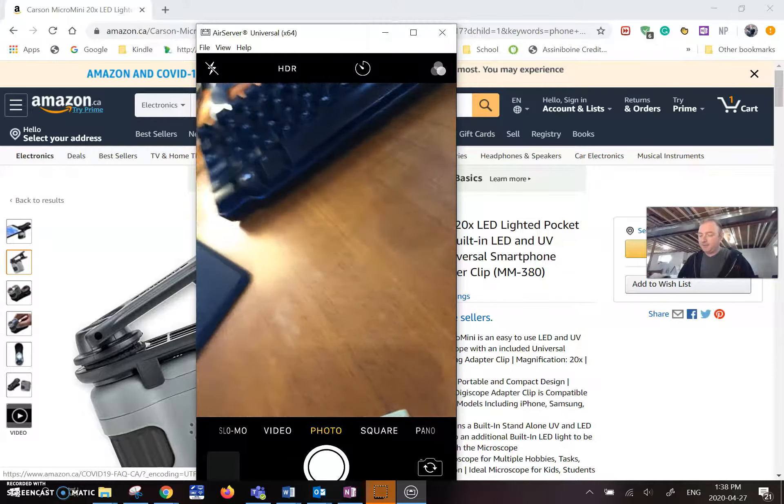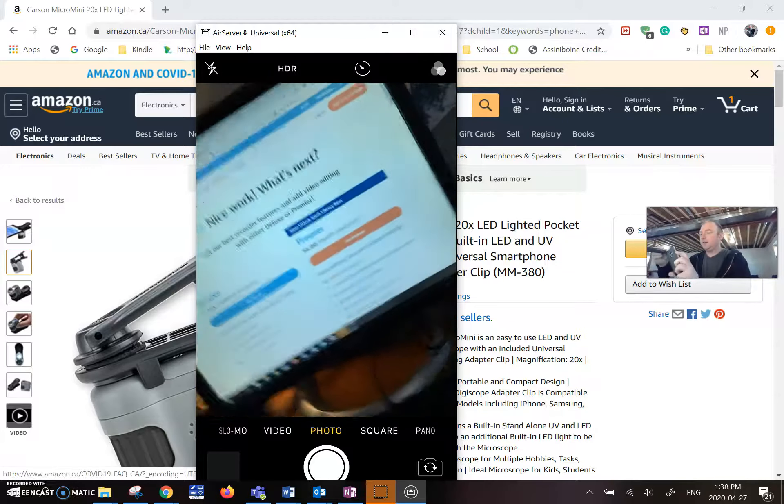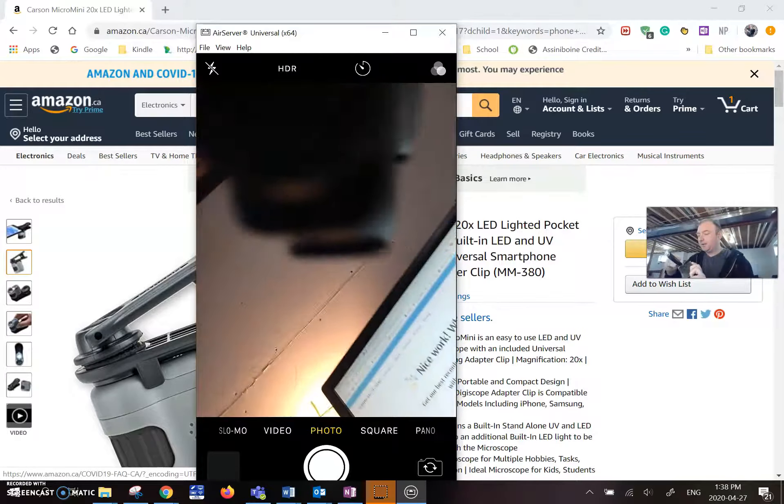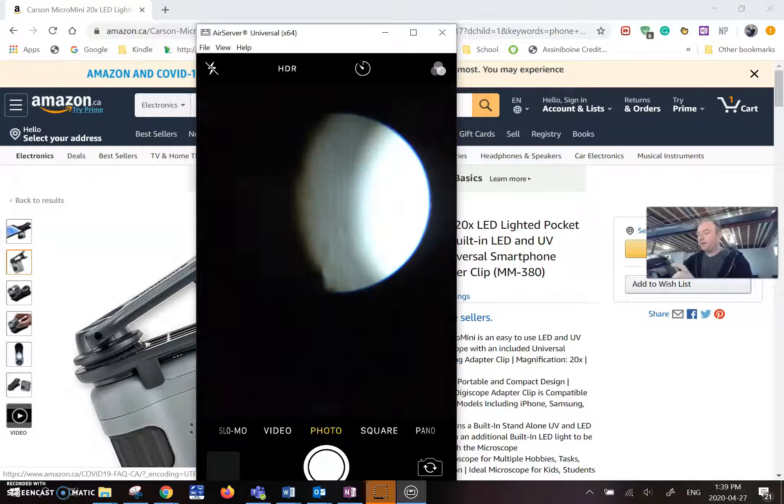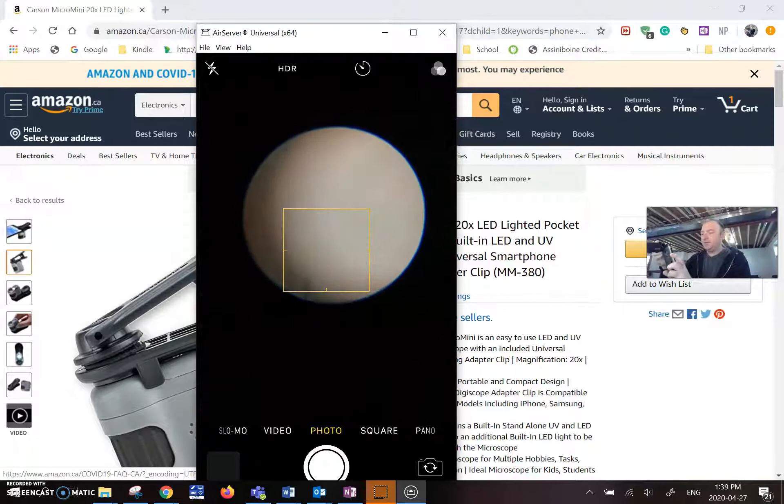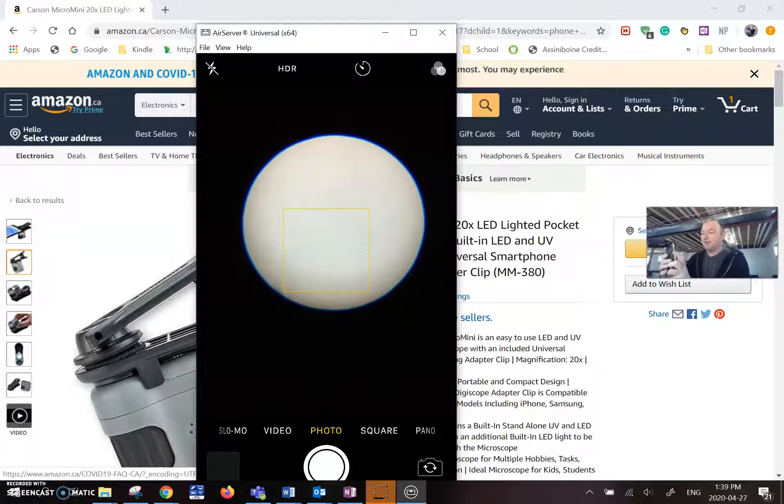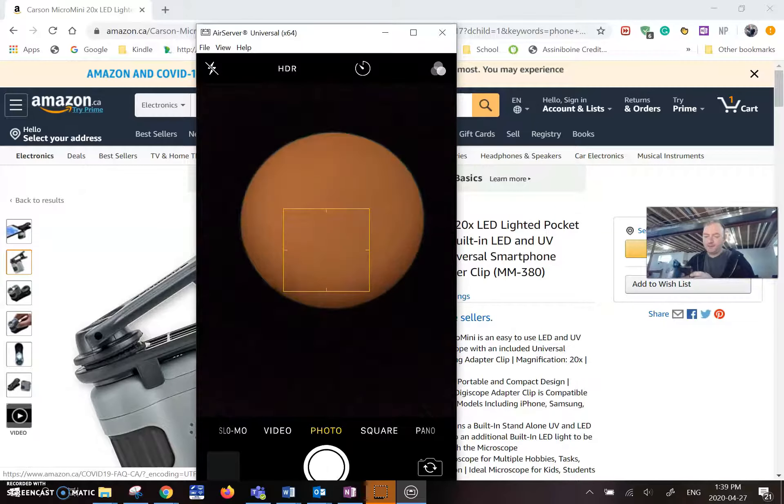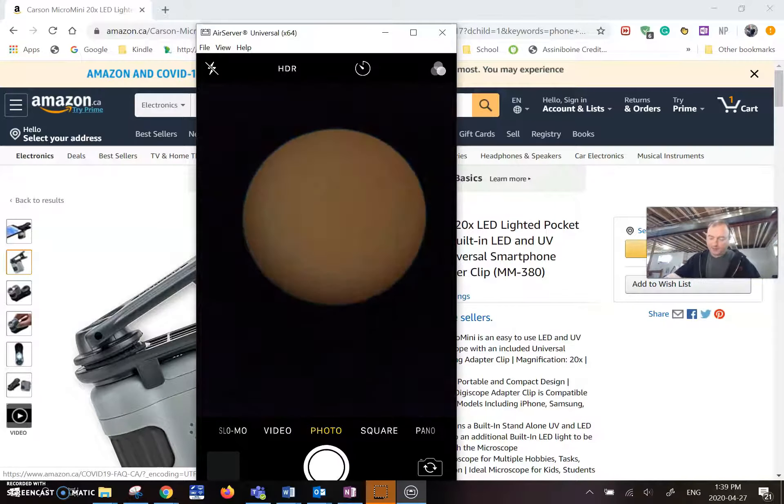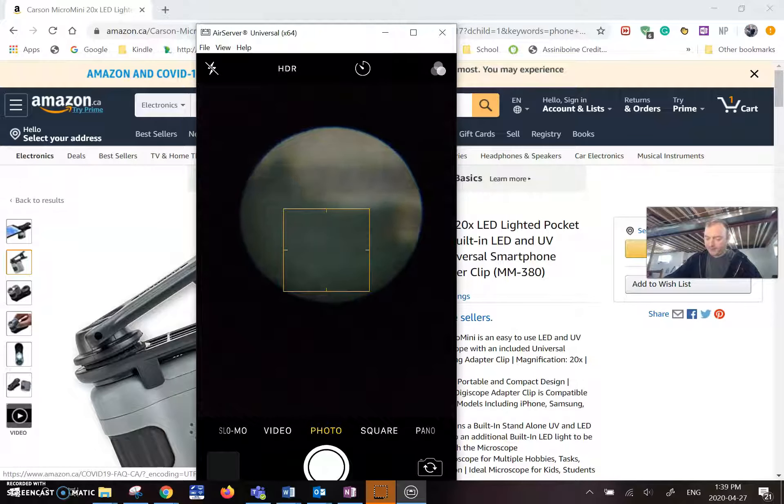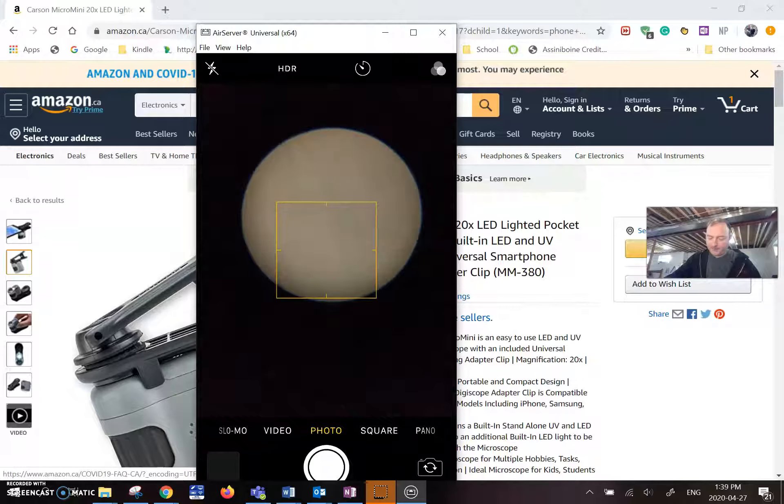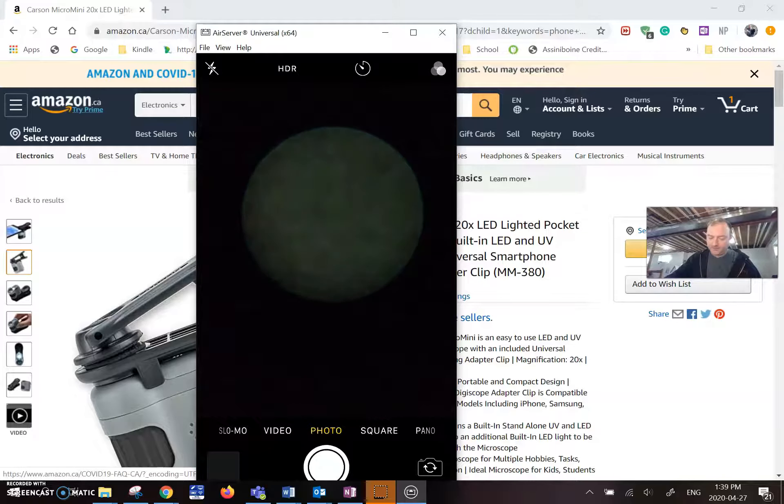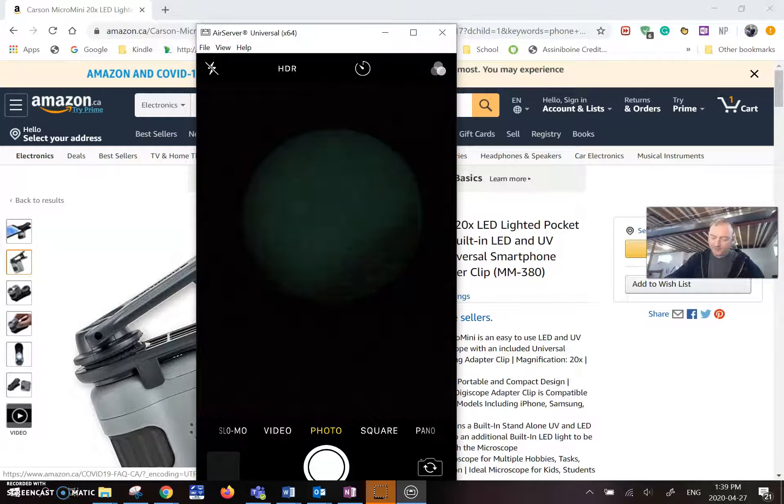With 60 times magnification, it's a little tough. It zooms in quite far. But I use the light on my screen to adjust where it overlaps. A nice bright light helps you get it centered. So you can see I'm centered there. Then what I'm going to do is I'm going to turn on. You can see it without the light. And I'm on the fake dollar bill. There's an adjustment for, of course, focus.